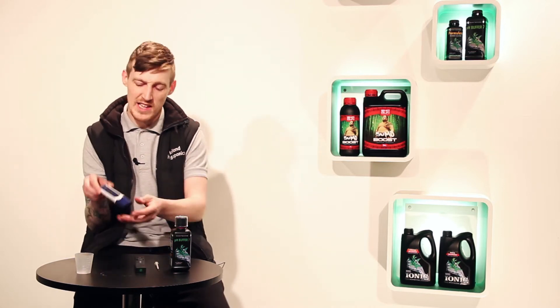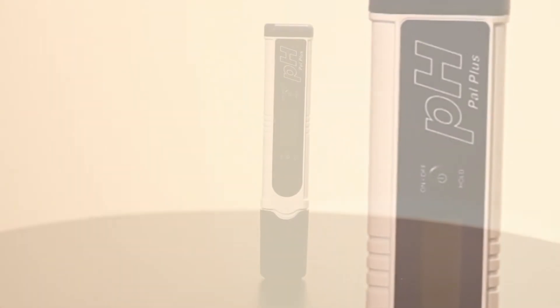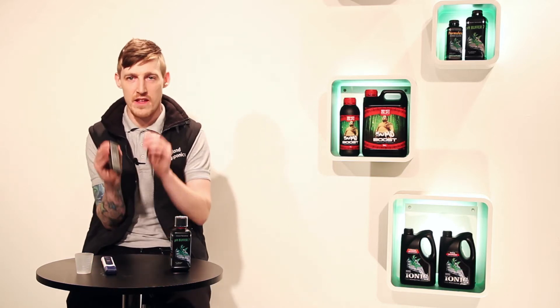The next one, which is what we class as more of a higher range pH pen — everything's actually done digitally inside the pen. You pop it in your solution, you press a few buttons and calibrate it. So from that, I will now show you how to calibrate the budget pH pen.